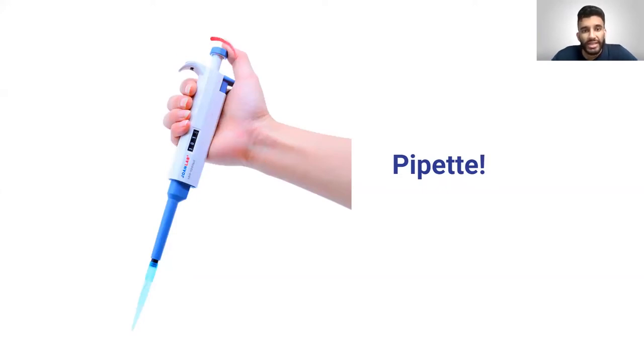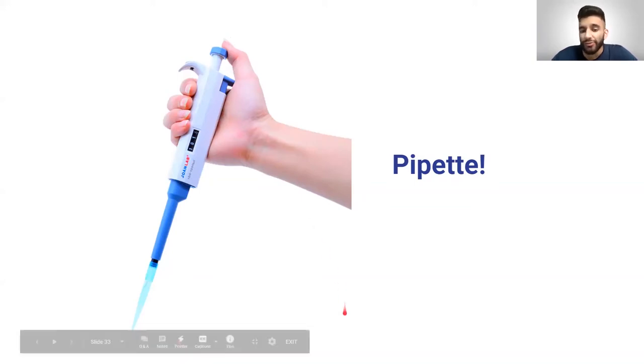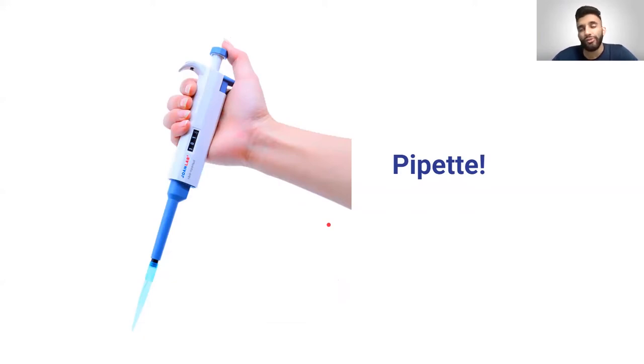This knob on the pipette can be adjusted to change the number, which shows you how many microliters you're taking up. Doing research in a lab is very similar to cooking — just like a recipe gives you specific amounts like four eggs or five ounces of milk, in a lab you have different amounts of reagents to add. For certain protocols, they might say add 10 microliters of this DNA, 20 microliters of this buffer, and 10 microliters of water. You can adjust the amount of microliters with the knob.